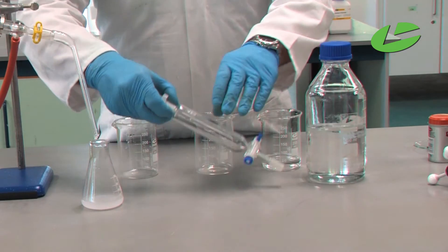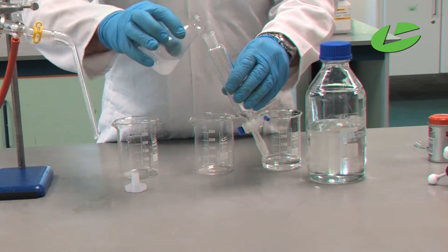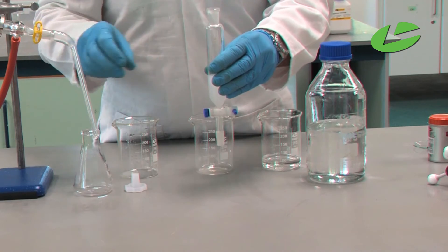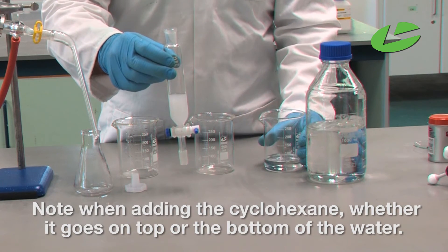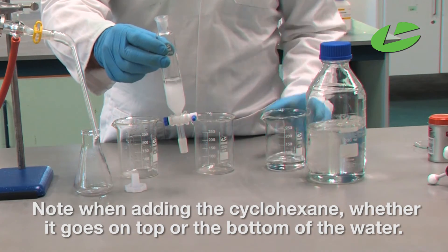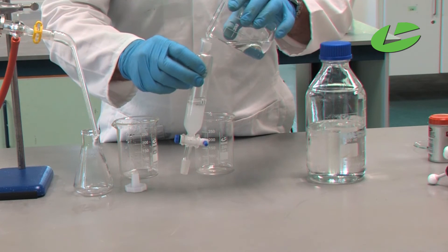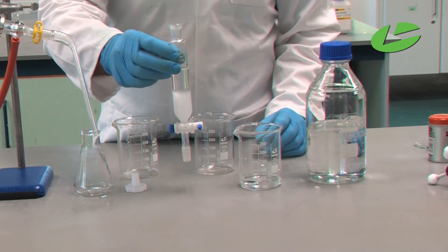I'm going to transfer my emulsion mixture of water and clove oil into the separating funnel, ensuring the tap is shut. I'm going to add the cyclohexane — take note when adding it whether it goes on the top or the bottom of the water. I'll add a small amount to start. You can see how the cyclohexane sits on top of the water — so that is the layer where the clove oil is going to go. I'll add some more cyclohexane now, and confirm that the cyclohexane is on top of the water.